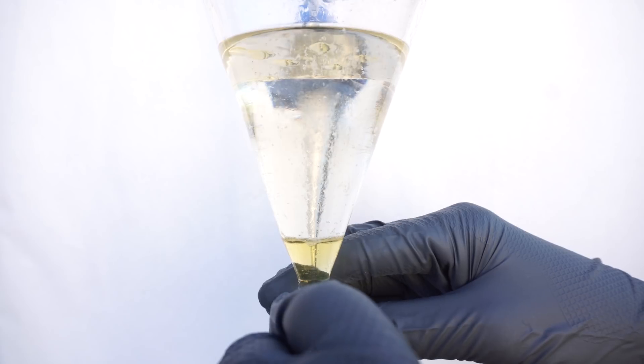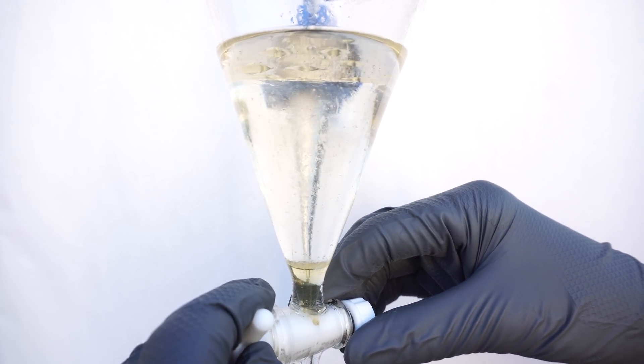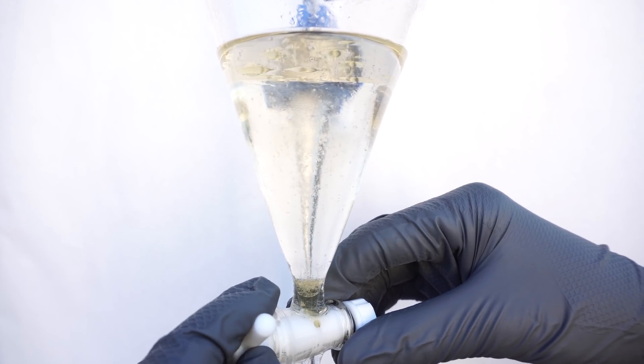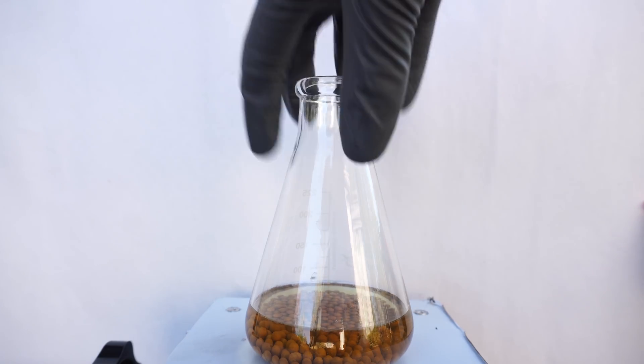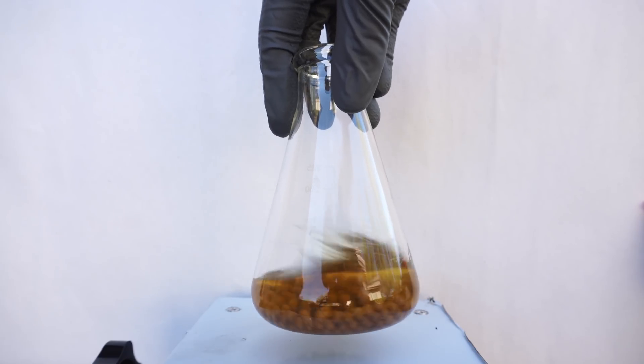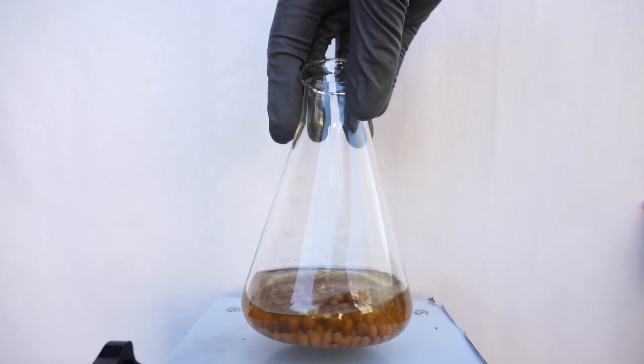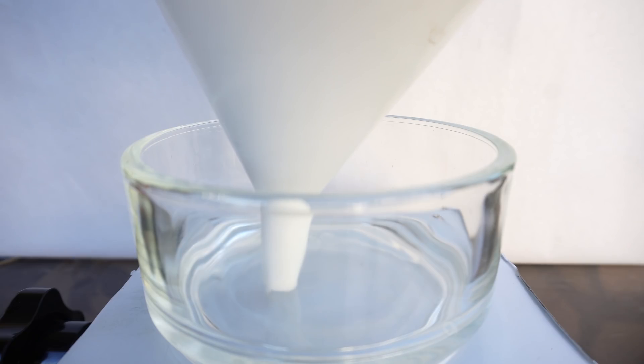I then drain my DCM layer into a clean flask filled with molecular sieves. I use 3A molecular sieves specifically, though you could have used something like calcium chloride too. This will continue to dry the DCM. I leave the sieves in for about 20 minutes with occasional mixing. Then we filter the sieves from the DCM into a recrystallization dish, followed by washing the sieves with a small amount of DCM and adding that as well.